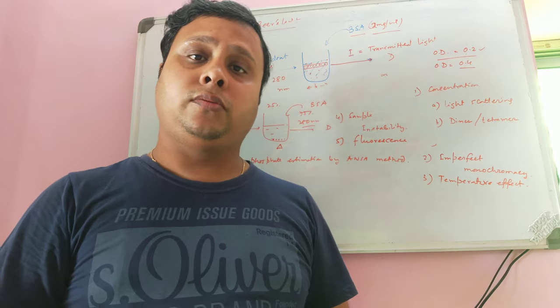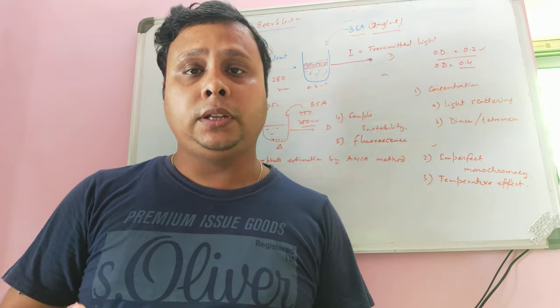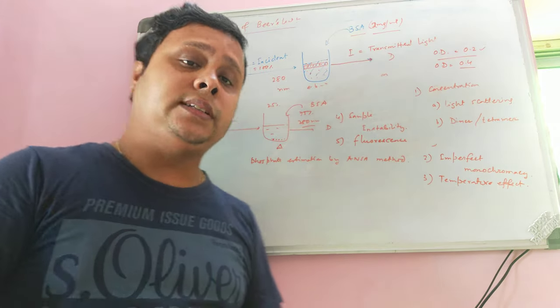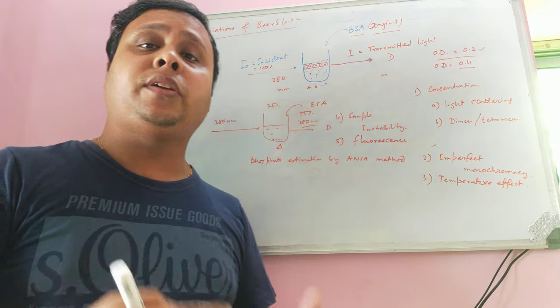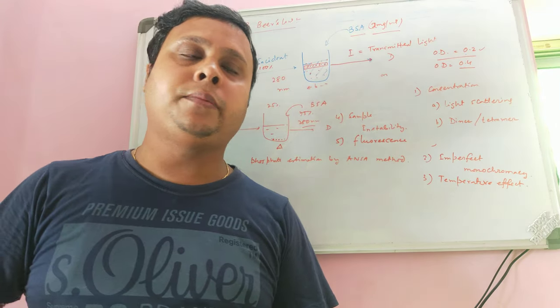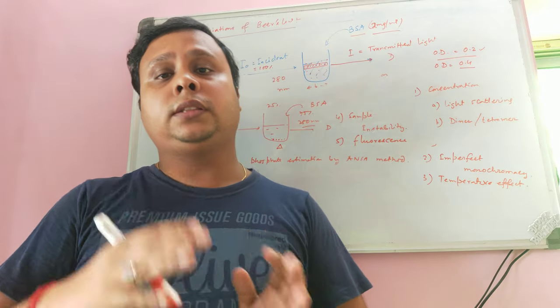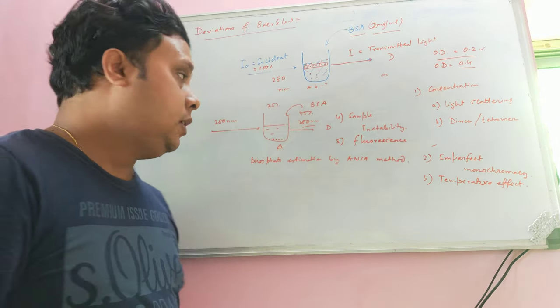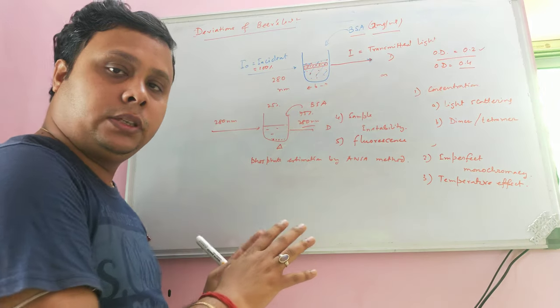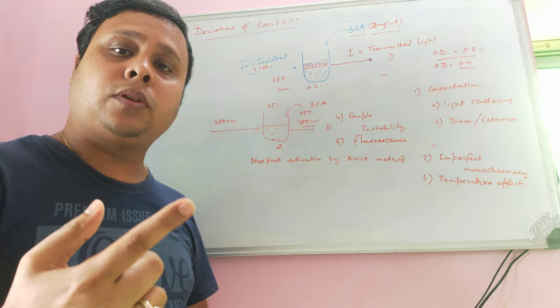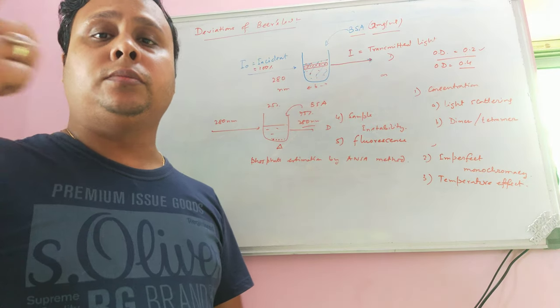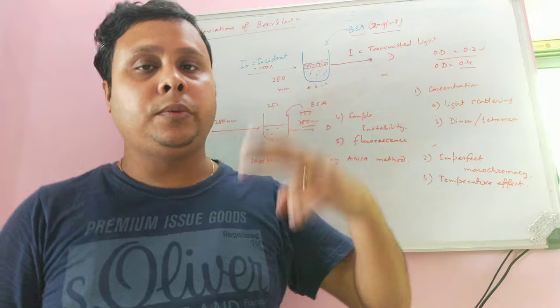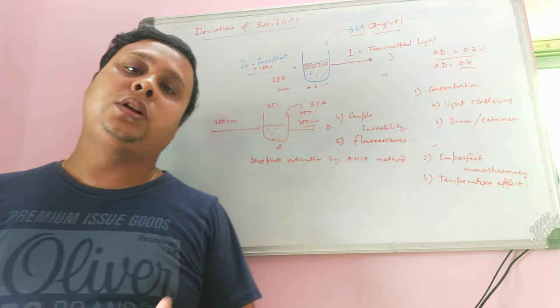However, if the sample contains fluorescent molecules such as fluorescamine or rhodamine, after receiving 280 nm light they will emit light of a longer wavelength — for example 300 nm or 320 nm, always greater than 280 nm. In that case, the detector will receive two different wavelengths: the transmitted 280 nm light and the fluorescence emission at a longer wavelength. This causes the actual OD value to differ from the expected value.